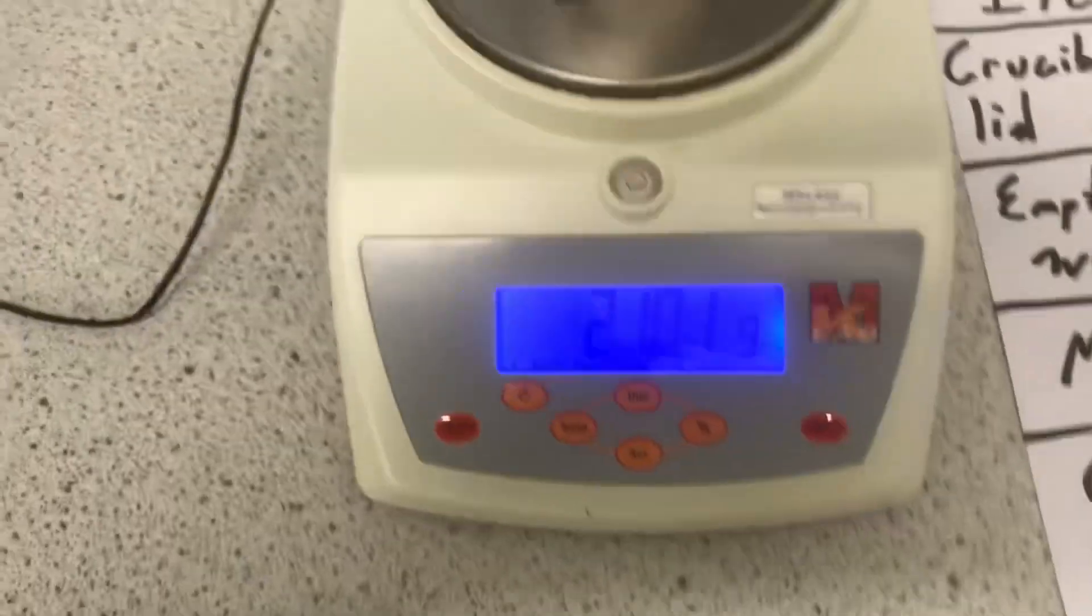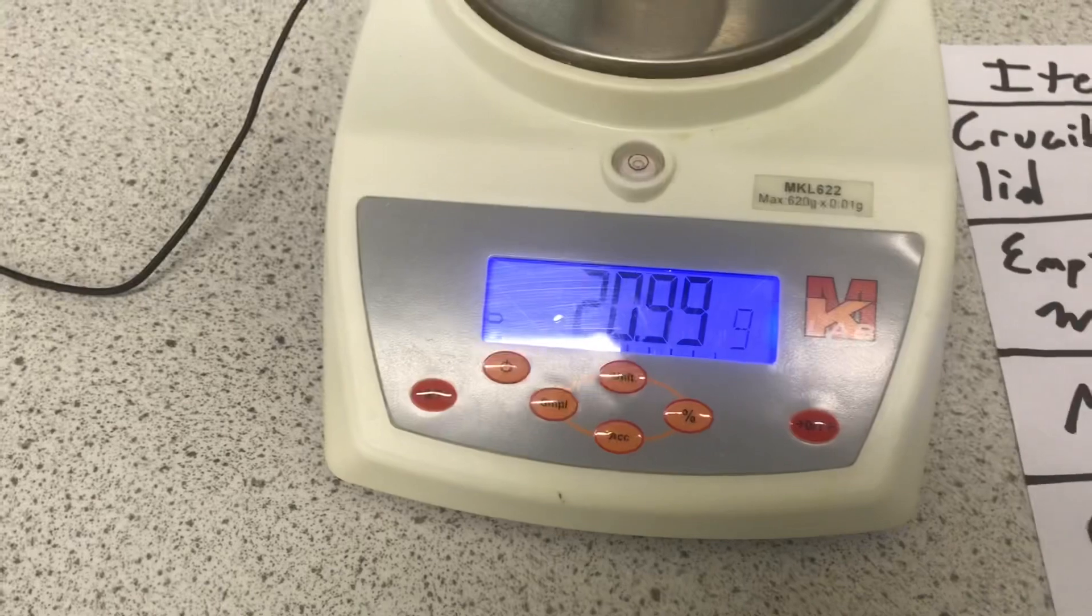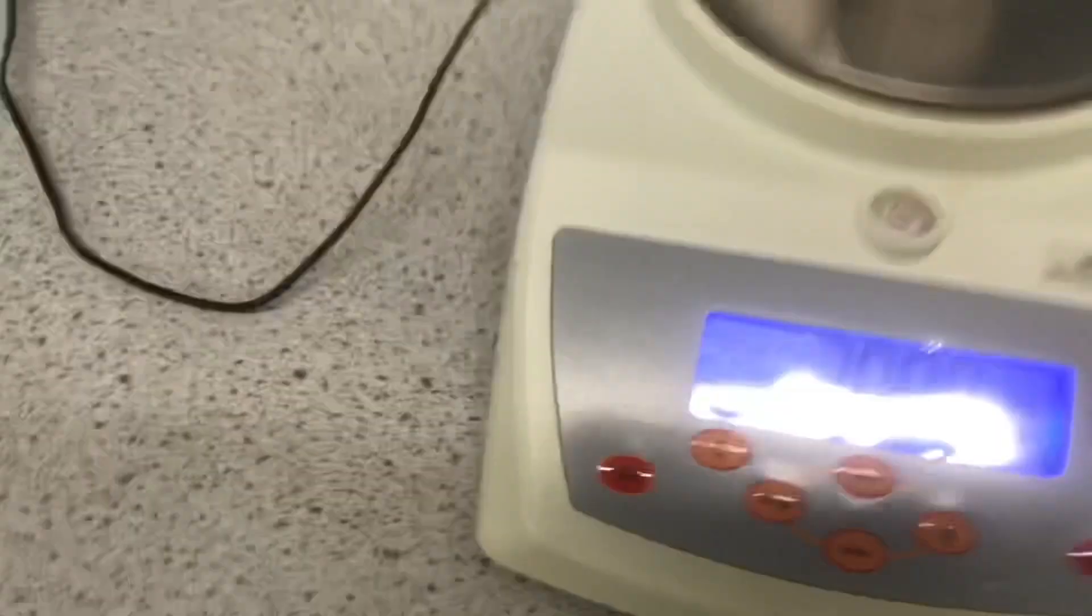Now, I'll just remove the magnesium to find the mass of the empty crucible with the lid, which is exactly 20.99 grams.